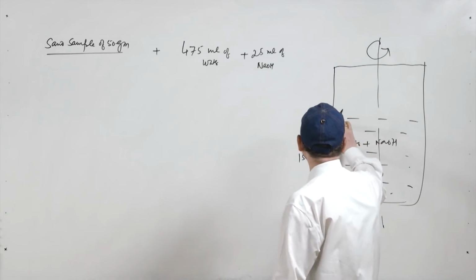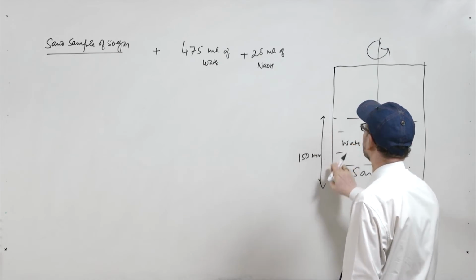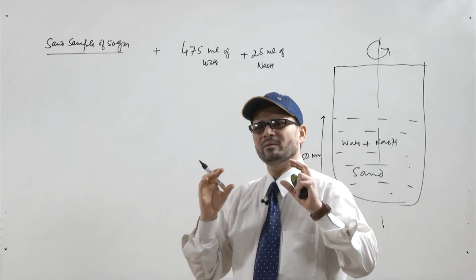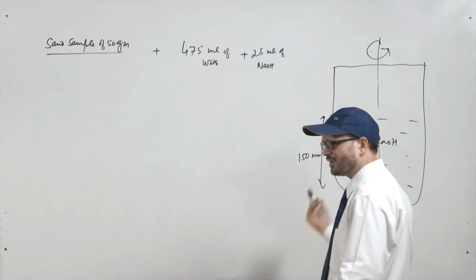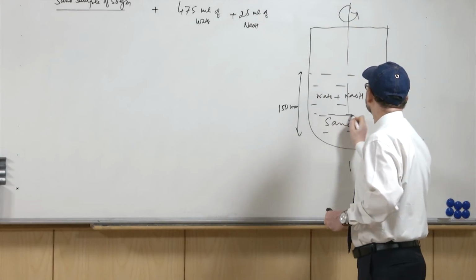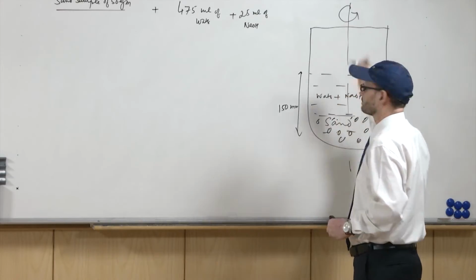So, after allowing it to settle for 10 minutes, you will siphon the water up to, say, 125 mm depth, and then this is continued many times, and every time you are disposing of this extra water which is above the sand. So, you have the sand mass and this is water.